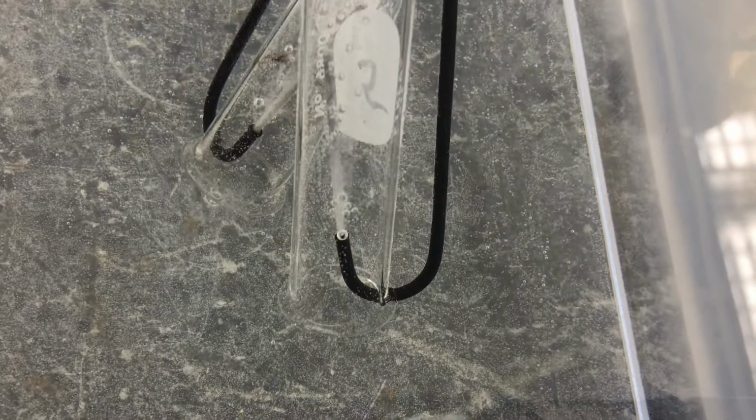Now, it's going to take a little bit of time for this reaction to happen. And part three is when we're going to come back and show you the results of this lab after it takes a while for the reaction to occur. We have to put energy into this reaction for quite a bit of time in order for it to occur.